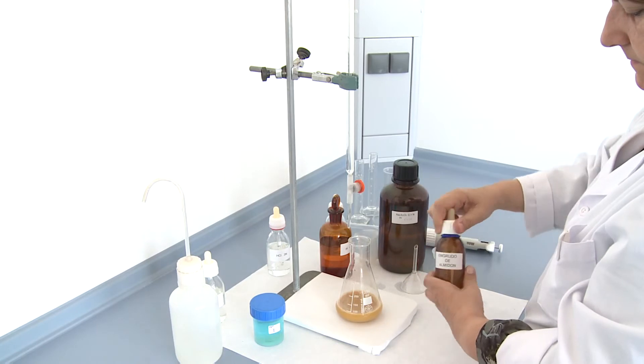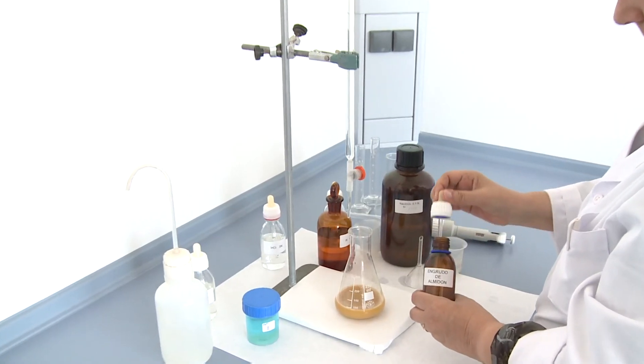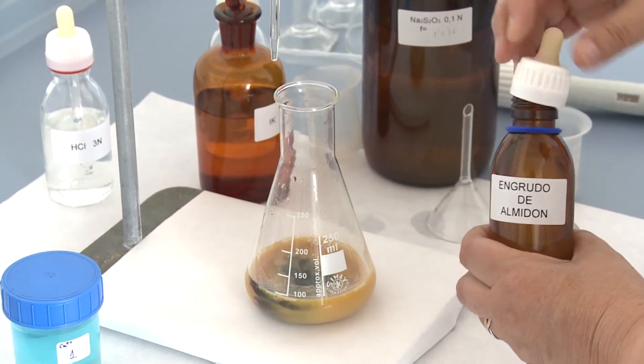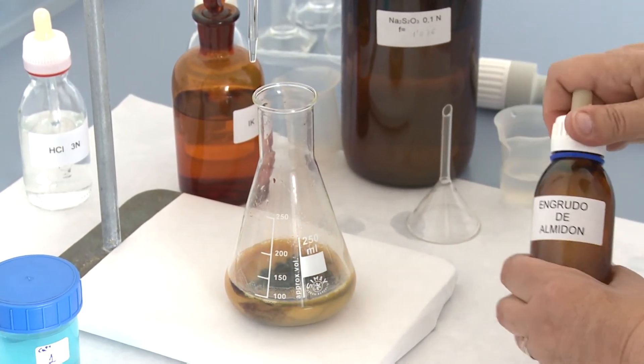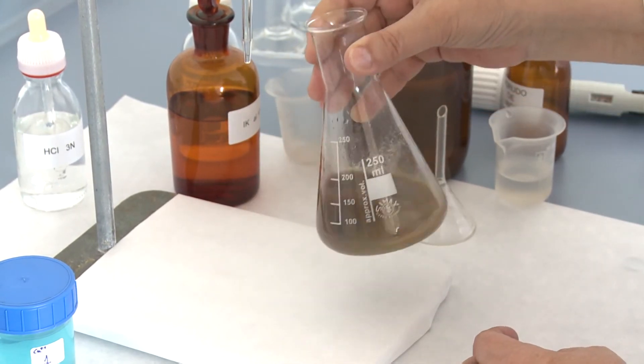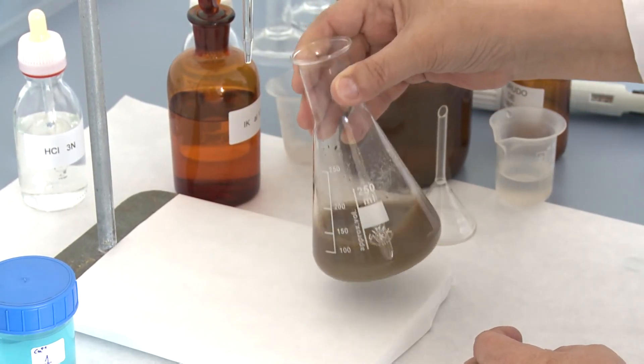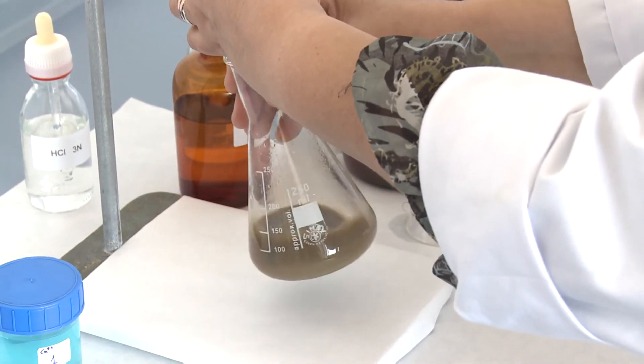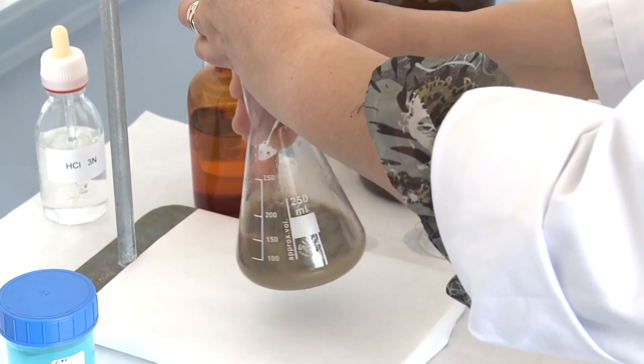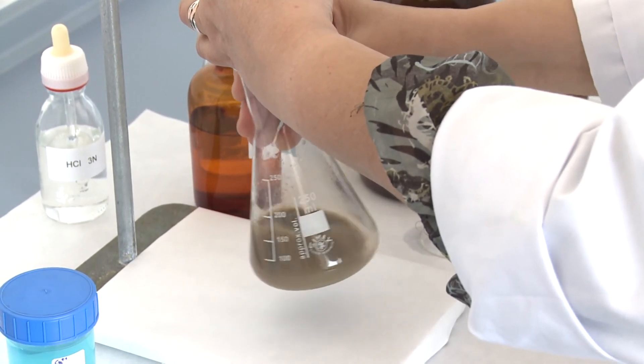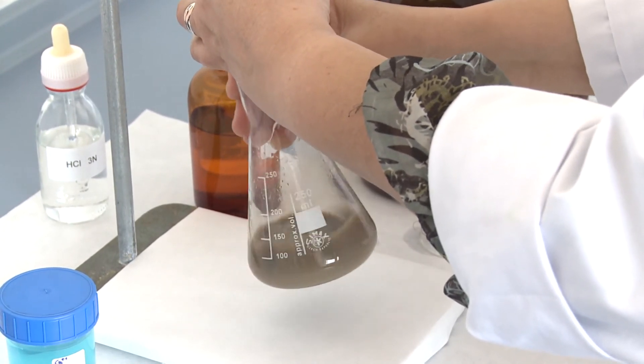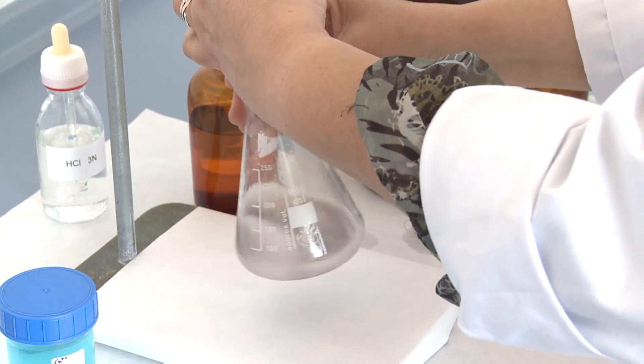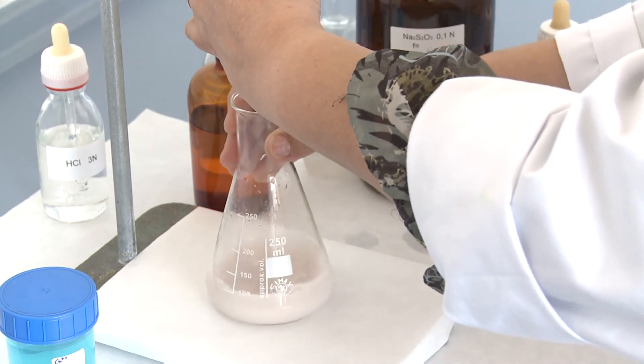And then add some drops of starch solution. The solution will become dark blue and we will continue titrating until a milky white color appears. This is the end point of the titration.